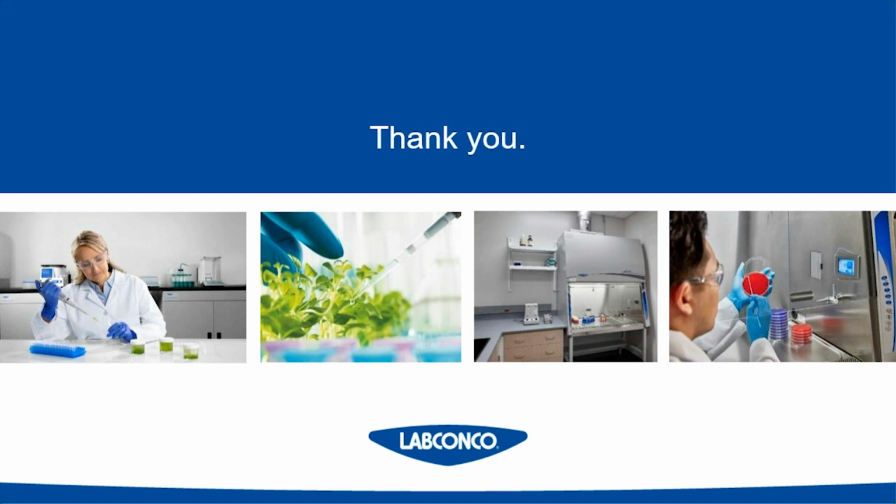As far as the maintenance, biosafety cabinets are certified usually on an annual basis. In some GMP and cell culture facilities or pharmacy applications, they're certified every 6 months, which means that a certifier comes in, they make sure the inflow and downflow are correct, they scan the HEPA filters and check for any leaks, and just make sure the biosafety cabinet is performing as it should.